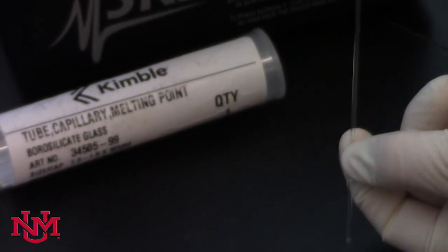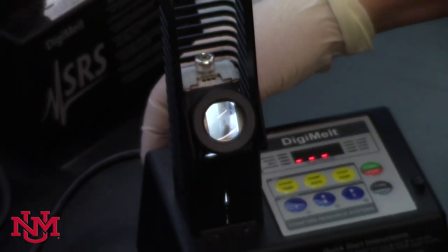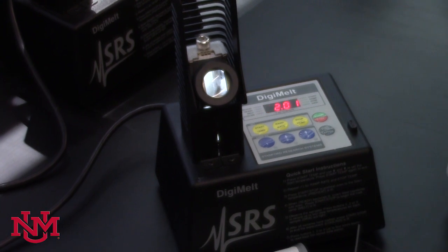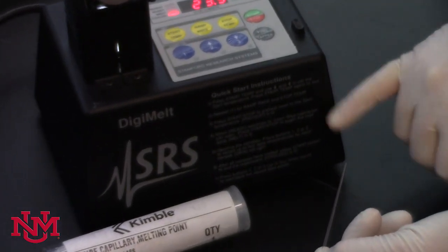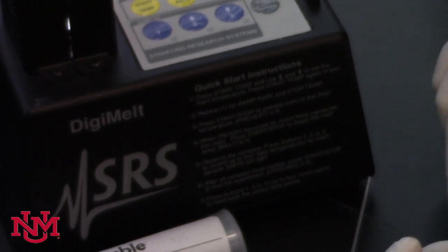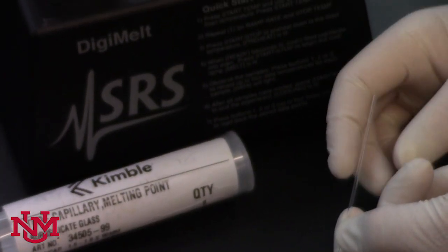You can turn on the digi-melt on the back side, and you'll hear some noises, and it should boot up. The instructions for using the digi-melt are printed right on the front, and we also have information sheets in the same area of the lab.